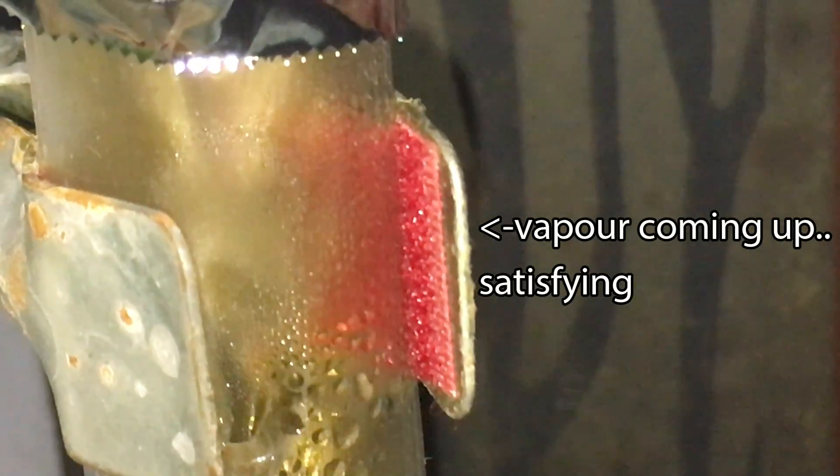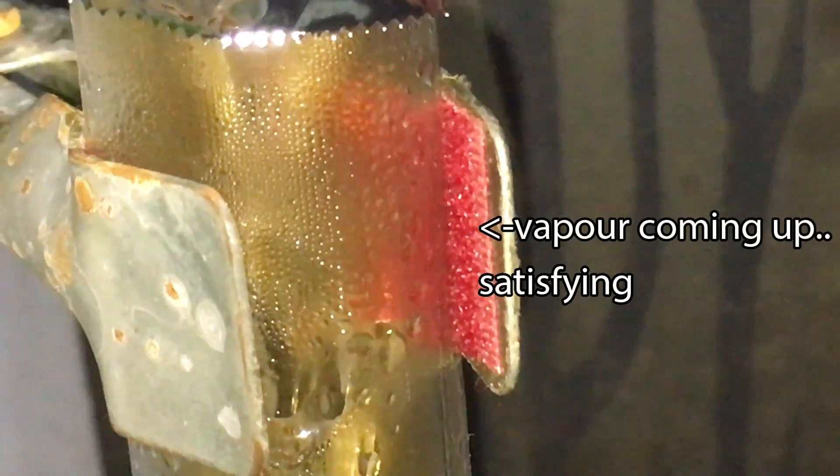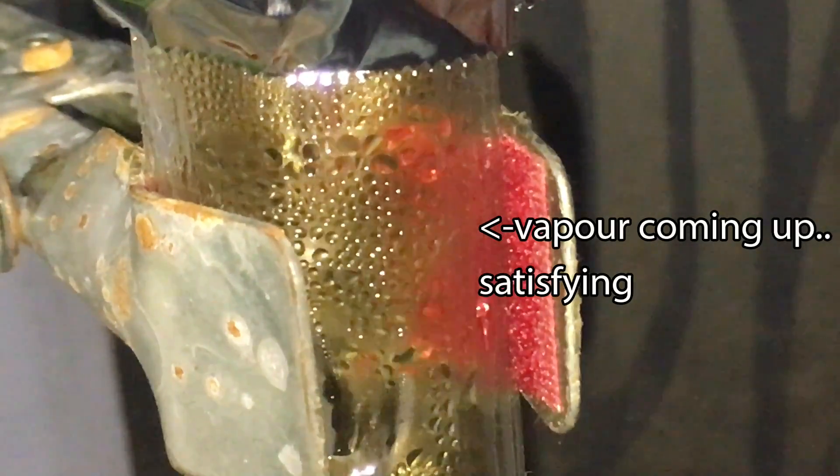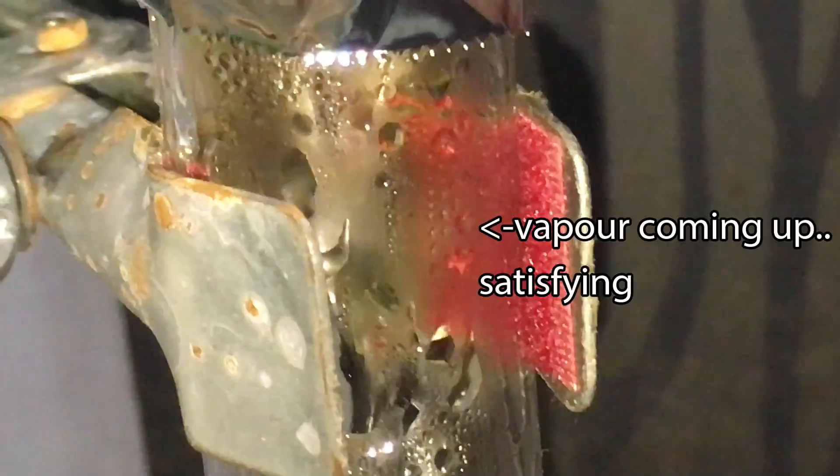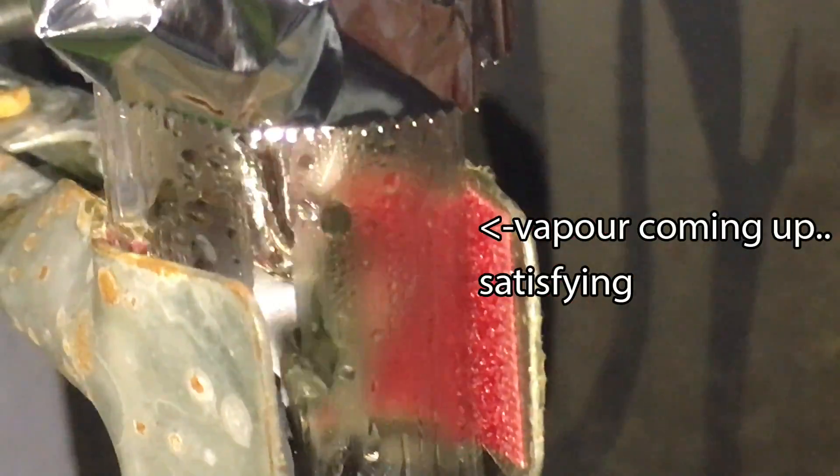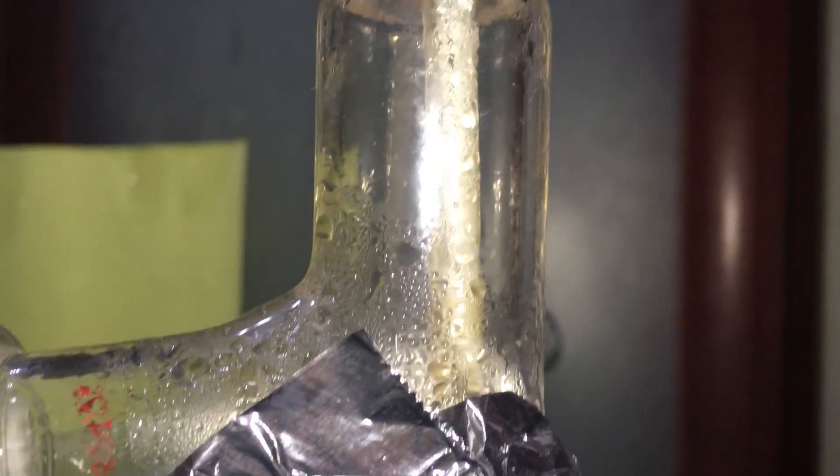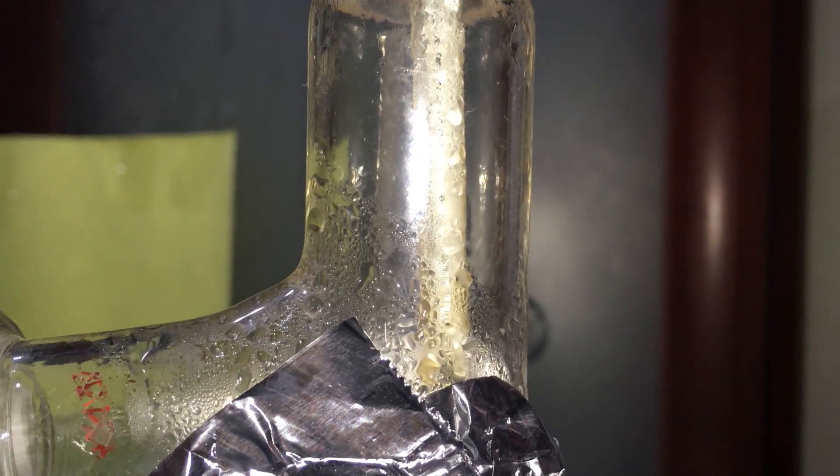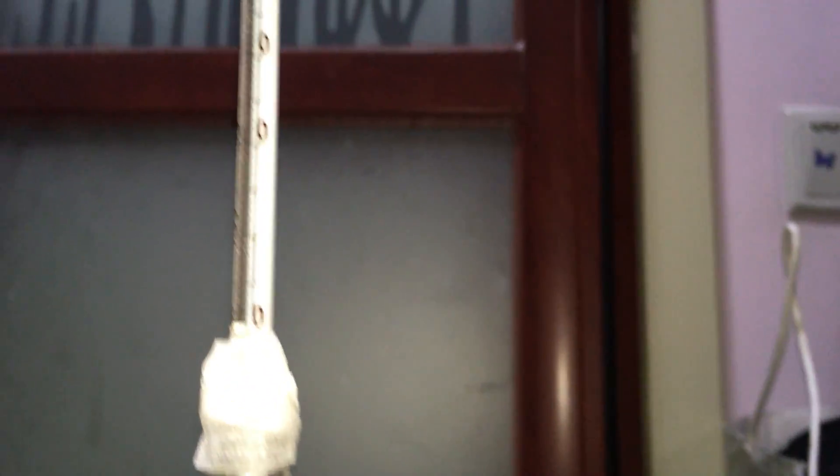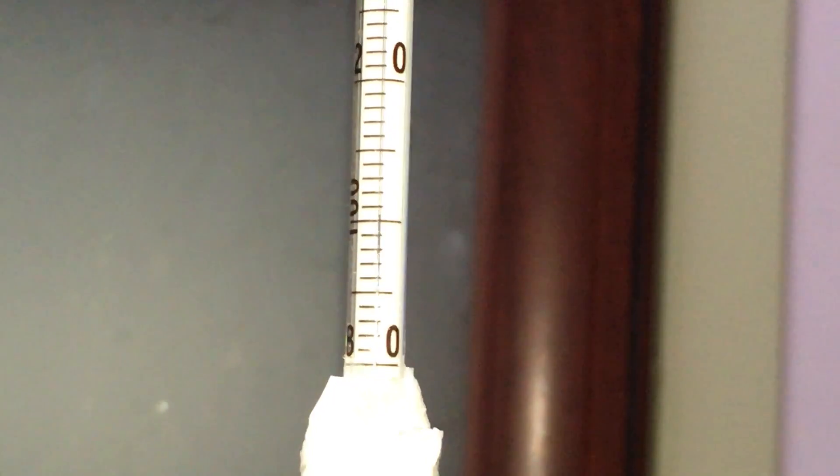The fractionating column is used to ensure that the water comes off before the nitric acid does. If you don't have one, never mind and just set up a simple distillation system, but your yield will be a little bit lower. As you can see, the vapor is condensing and climbing up the fractionating column. Now the vapor has made it over. The temperature now is around 100C. It indicates that water is being distilled off. The distillate being collected is useless and is discarded.